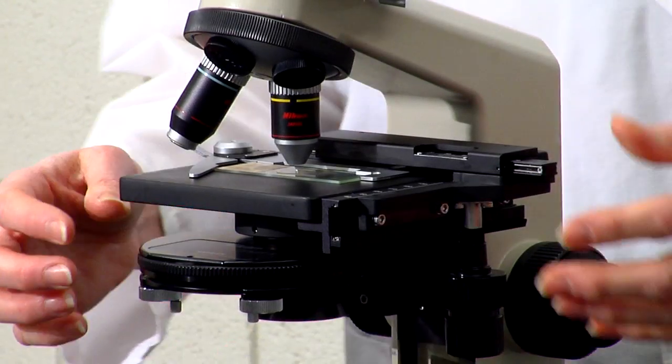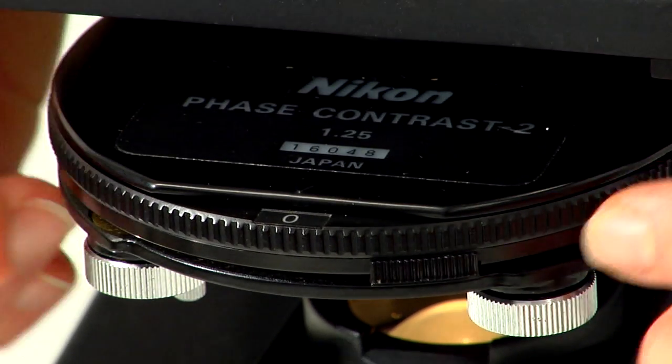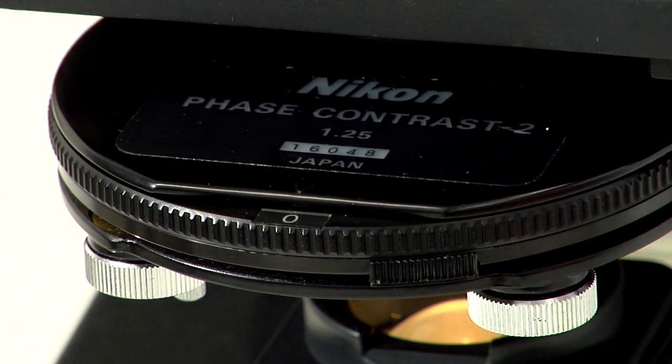You will need to set the rotating disc in the condenser lens system to the zero position. You will also need to adjust the iris diaphragm on the rotating disc. This adjusts the amount of light that is allowed through the lens.